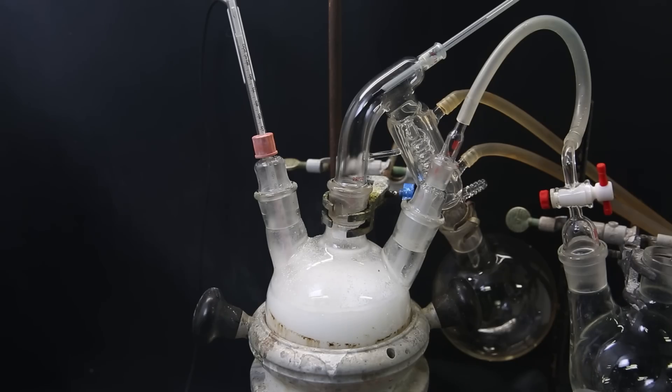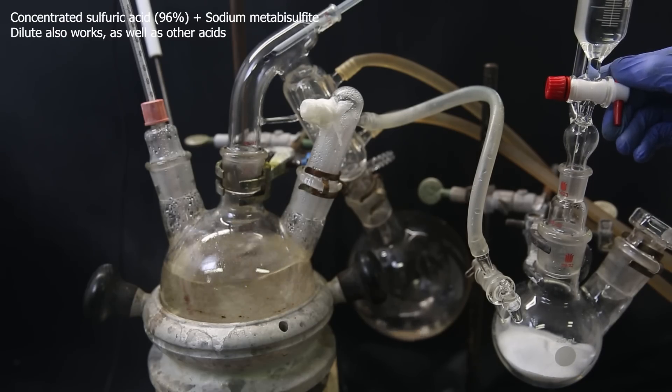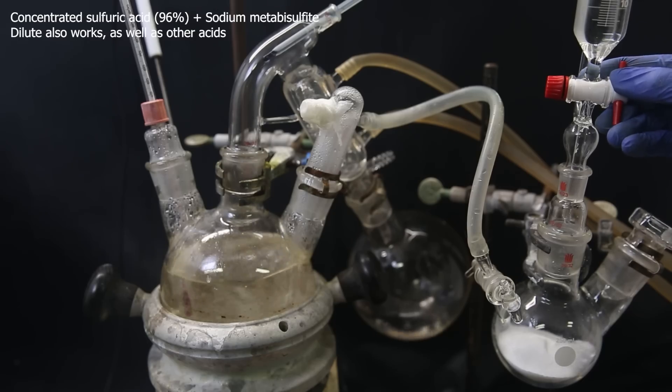Then to the gas inlet tube, I attach a sulfur dioxide generator, which is just a flask that I fill with sodium metabisulfite, and then gradually drop concentrated sulfuric acid into it. But dilute acids and other acids are also fine. Later, I ended up changing the gas inlet adapter and the flask, because I needed the joint adapter for my dropping funnel, of which I apparently only have one. But it works the same.